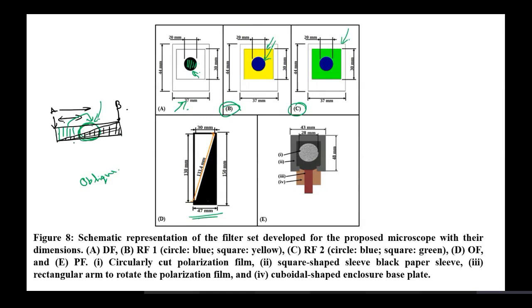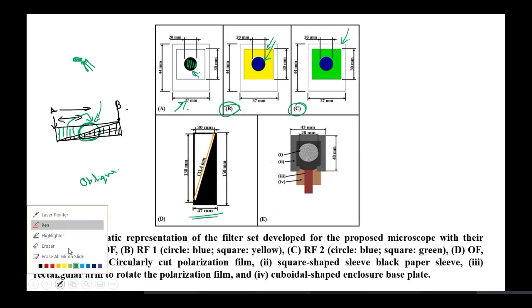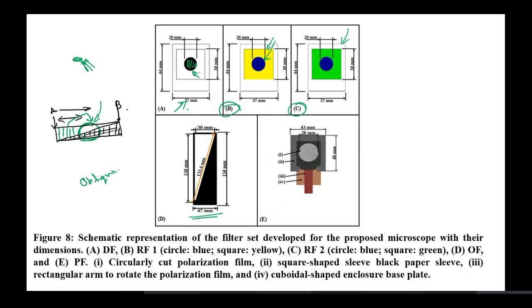Okay. Now, when you move this and look into the system, what is happening? Suppose you have this object over here. Now you are putting the light rays in a particular direction. Since the light is coming from this particular direction, the other side where there is no light will appear somewhat darker.